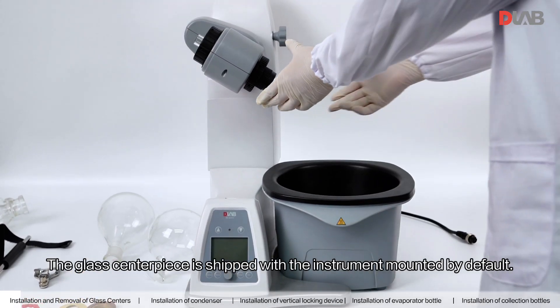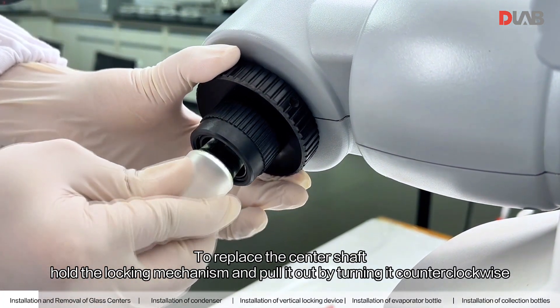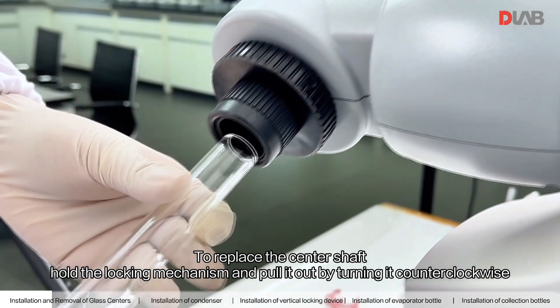The glass centerpiece is shipped with the instrument mounted by default. To replace the center shaft, hold the locking mechanism and pull it out by turning it counterclockwise.